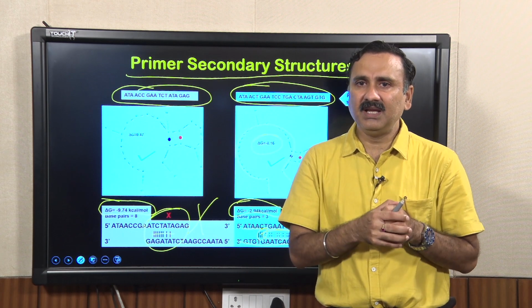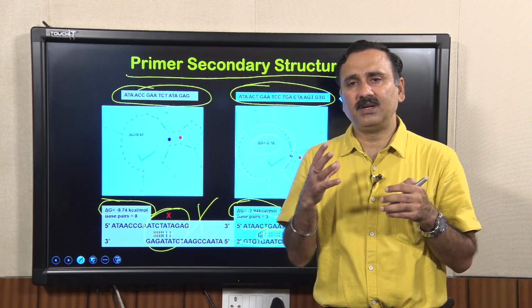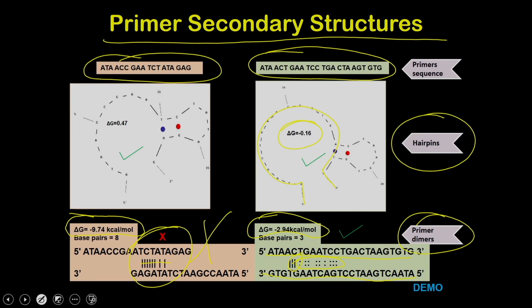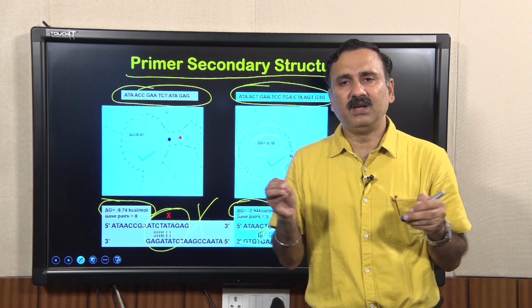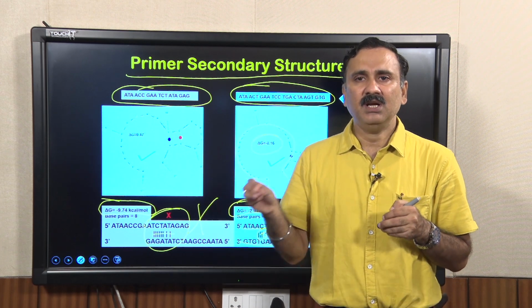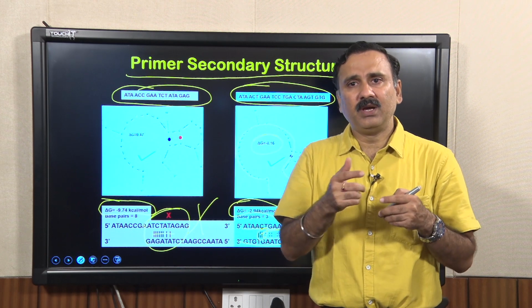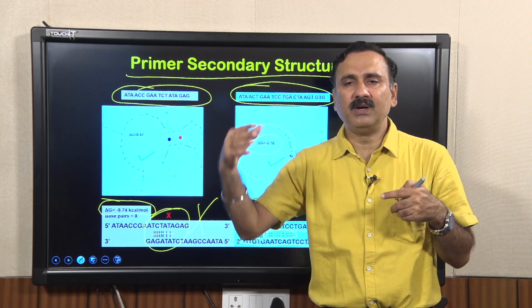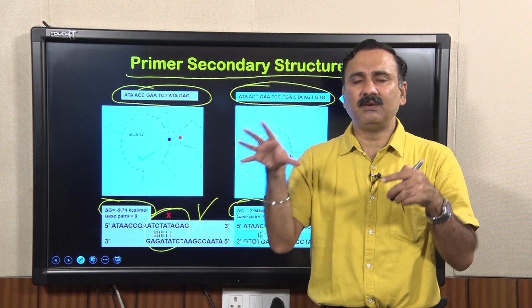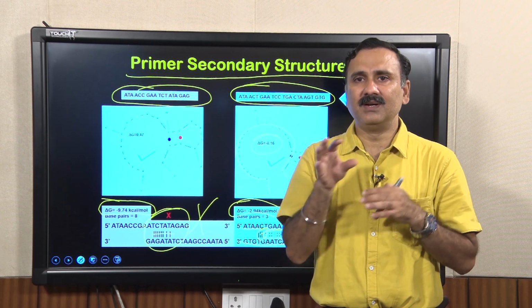the different aspects of primer designing and how you can analyze those sequences to decide whether your primer is bad or good, because that is very important. The primer is the crux of the whole story. If you design a bad primer, you are not going to get the amplification, because the primer gives the starting point for your enzyme to sit and start the synthesis. So primer designing is very crucial and important to understand.